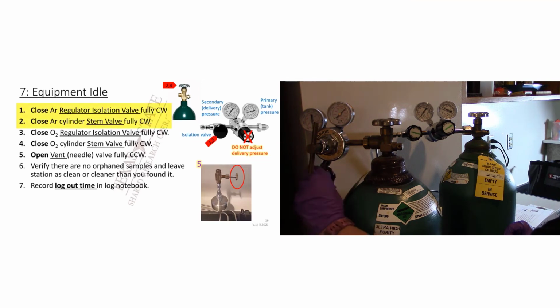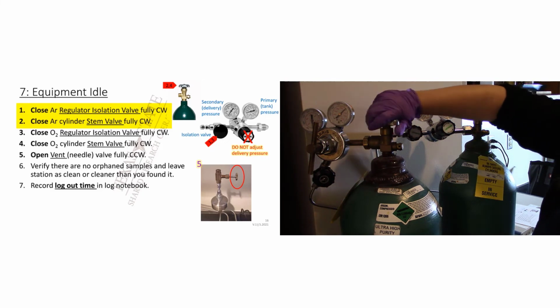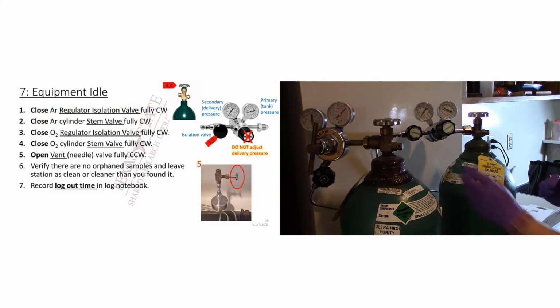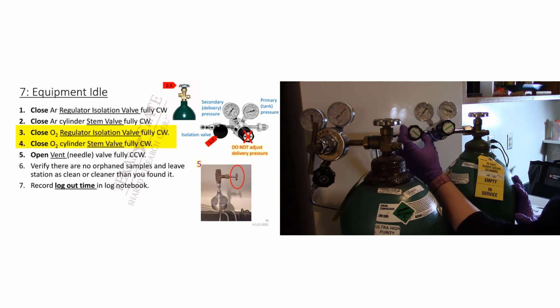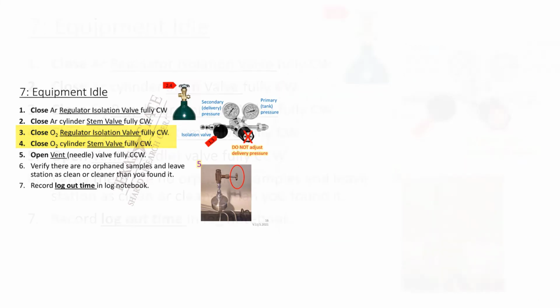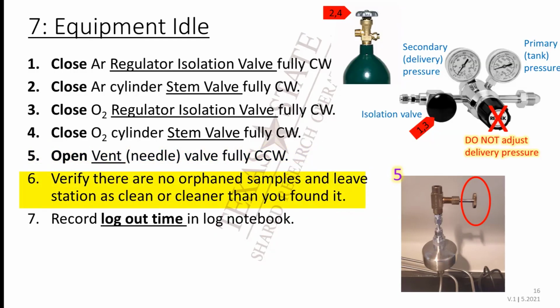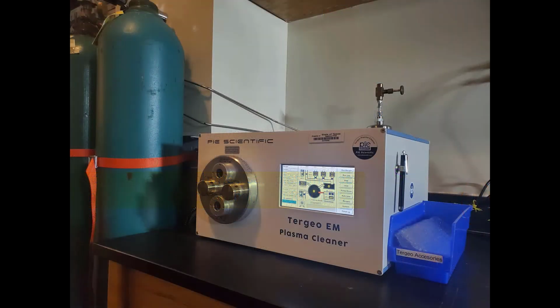To idle the equipment, close the argon regulator isolation valve fully clockwise. Close the argon cylinder stem valve fully clockwise. Close the oxygen regulator isolation valve fully clockwise. And close the oxygen cylinder stem valve fully clockwise. Open the vent needle valve fully counterclockwise. Verify there are no orphan samples and leave your station clean or cleaner than you found it. Record your logout time in the log notebook.